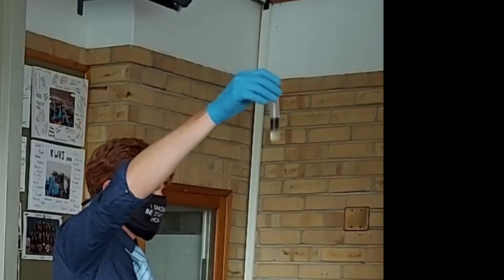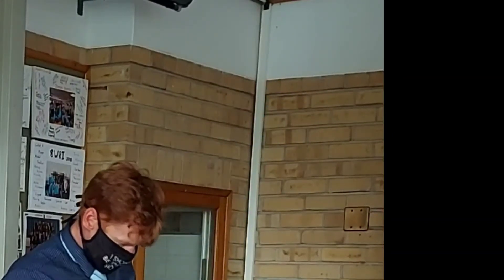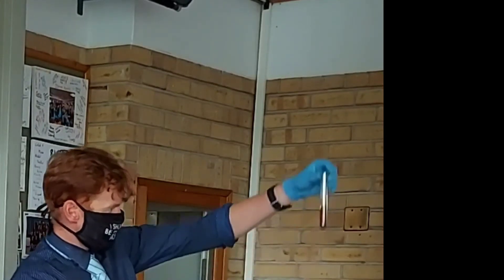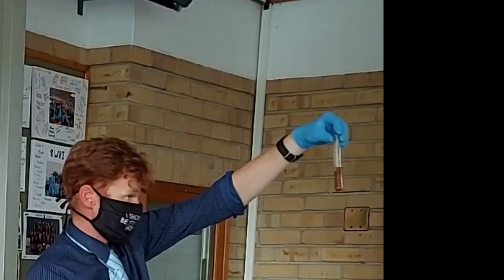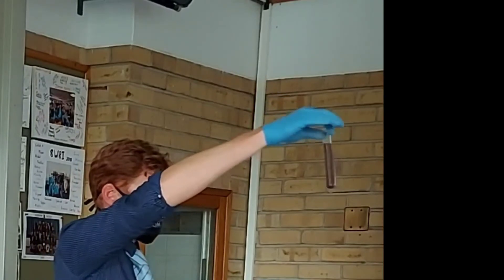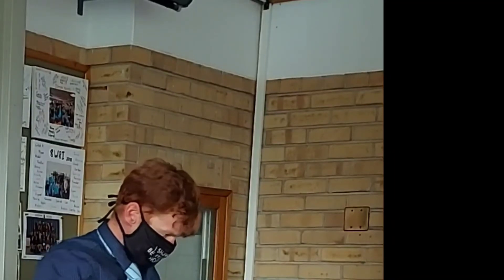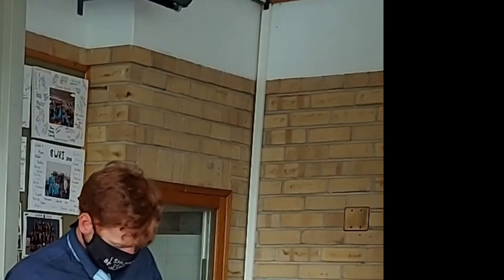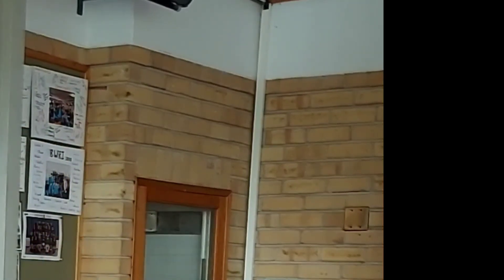The test for protein shows purple — dark purple. The test for reducing sugars — you can see this brick red, and this one is very dark, almost brown, but it's also red in there and green, so it does work, it just takes a lot of time. And then for the last test — test four — that's the fats test.